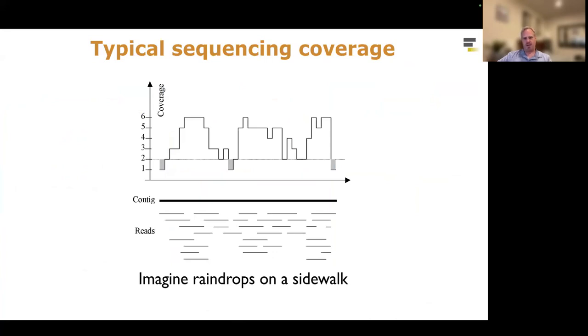And that's driven by this idea: the sequencing is random. There's no guarantees about where the reads are going to come from. So the strategy is to oversample the genome so that we have enough information that we can likely detect where there's overlapping reads.